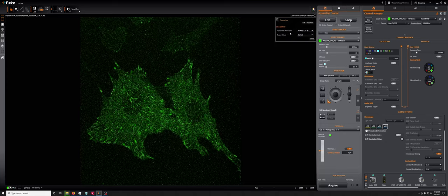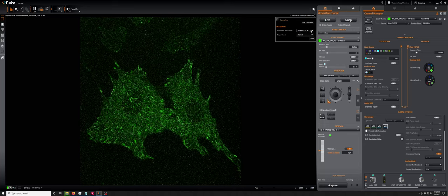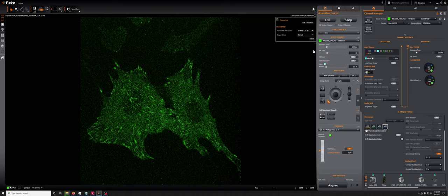By default, this will be set to 30 megahertz and 16-bit. That is optimized for speed, but if you switch it to 10 megahertz 16-bit, that will result in an image with higher signal-to-noise.